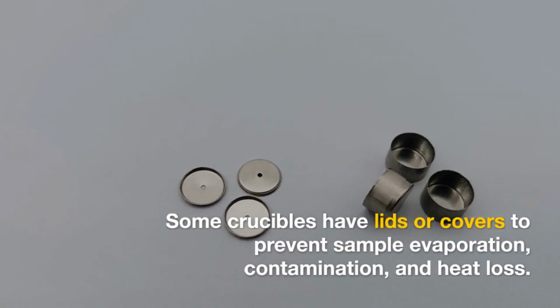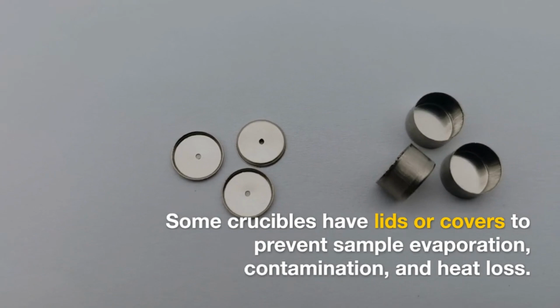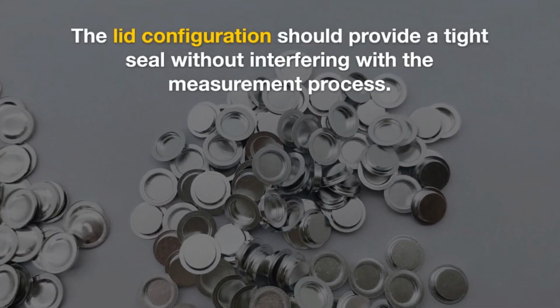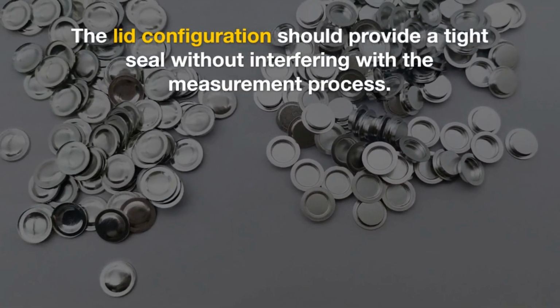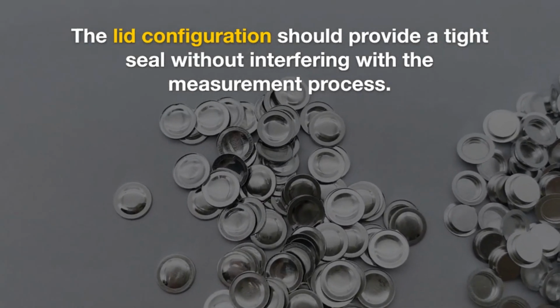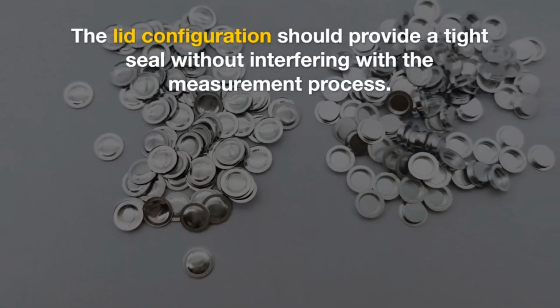The second, lid configuration. Some crucibles have lids or covers to prevent sample evaporation, contamination, and heat loss. The lid configuration should provide a tight seal without interfering with the measurement process. Consider whether a lid is necessary for your experiment, and choose a crucible with the appropriate lid configuration.